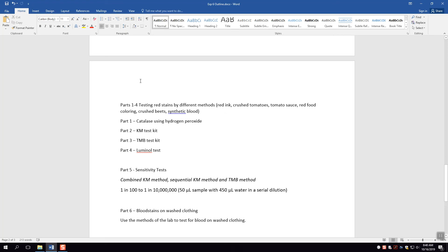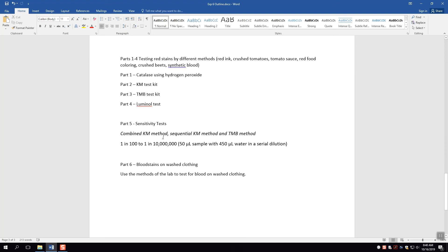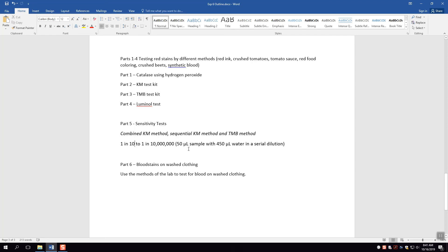The next thing you're going to do is a sensitivity test. Here you're going to do the combined KM method, that's where you mix the phenolphthalein and the hydrogen peroxide directly. The sequential KM method, that's where you put the phenolphthalein in first and the hydrogen peroxide in second, and the TMB method to test different concentrations of blood in water. First you're gonna do one in ten where you can take 50 microliters of a blood sample and mix it with 450 microliters of water. You're gonna use Eppendorf pipettes to do this, so you can ask your TA for a little bit of training on that.